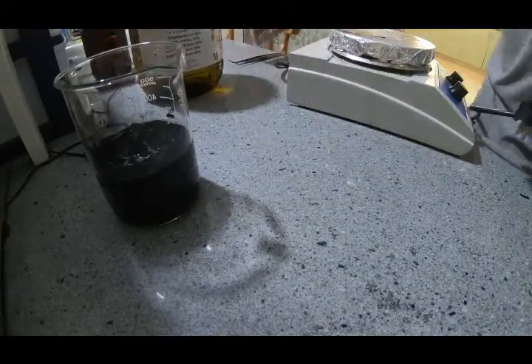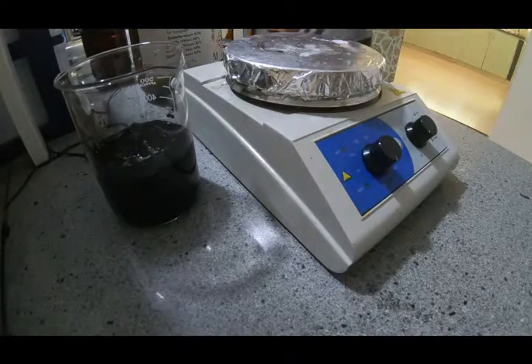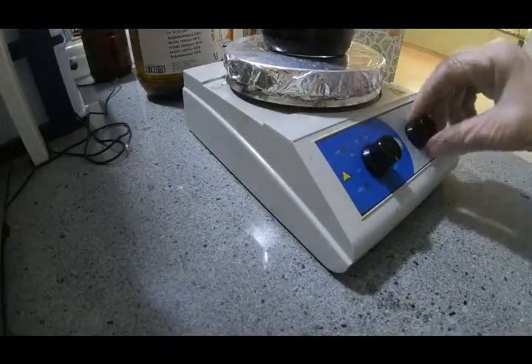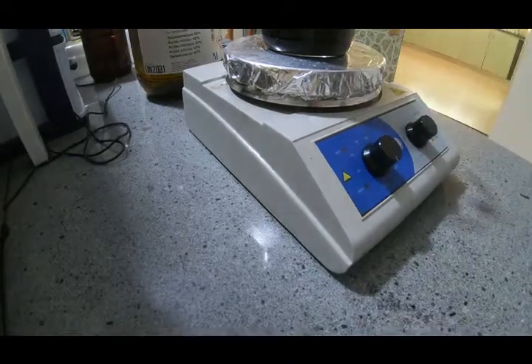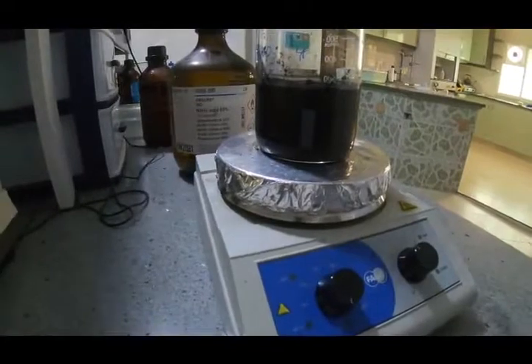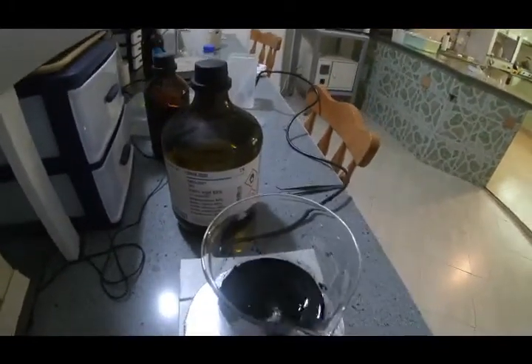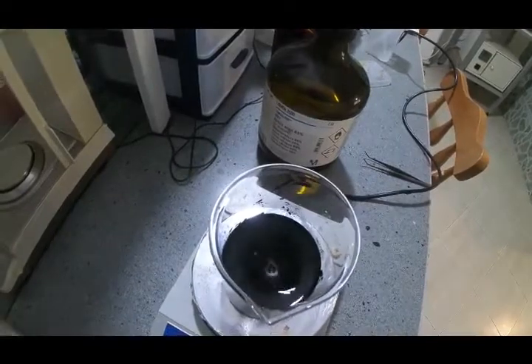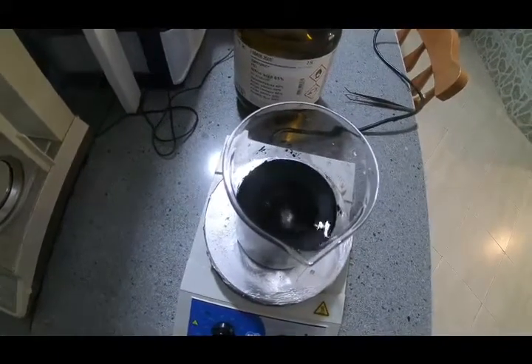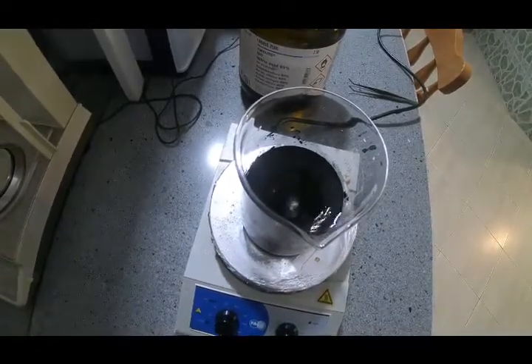Then you can just put it on a stirring plate and throw a stir bar on there, and just put it right there. Okay. Now we will wait for about 1 hour, 2 hours. Doesn't matter, just wait more than 1 hour, I think.